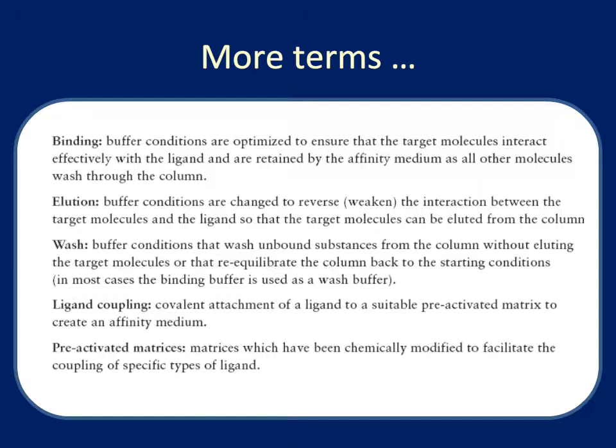In fact, the first three terms are used for any chromatography. When we talk about binding, we're talking about a condition in which the protein that is going to be purified can interact with the ligand. And so when we load the protein on the column, we're binding the protein to the ligand. For most affinity chromatography types, the buffer conditions are very important to facilitate that binding event.